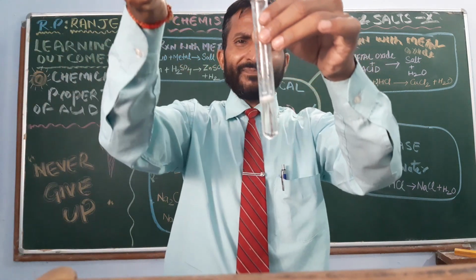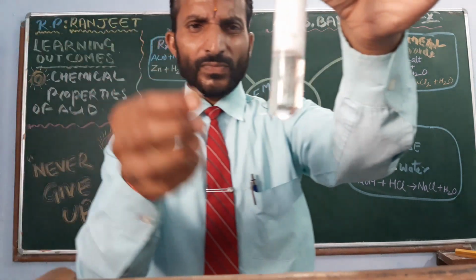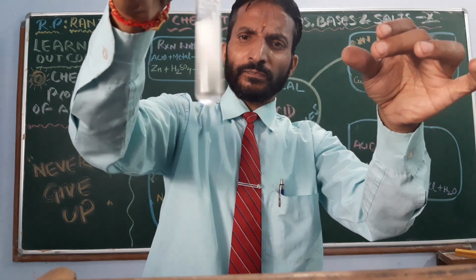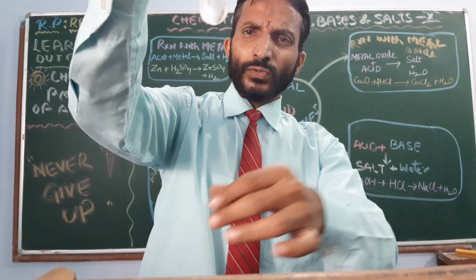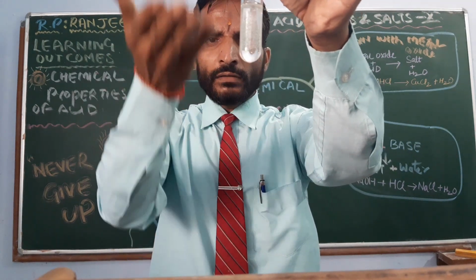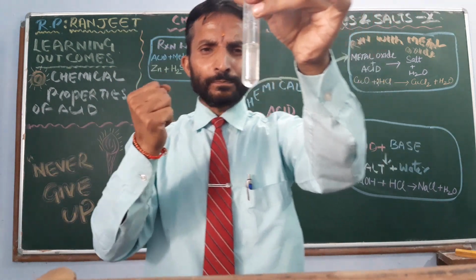but you will see gas is produced. There is a gas in the form of continuous bubbles. Because the acid is concentrated, all the sodium carbonate reacts at a faster rate.